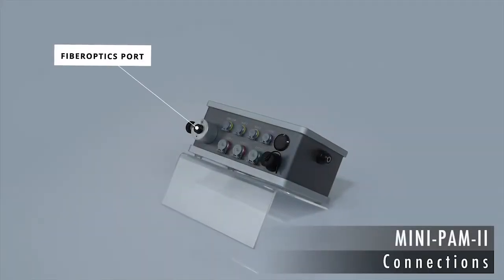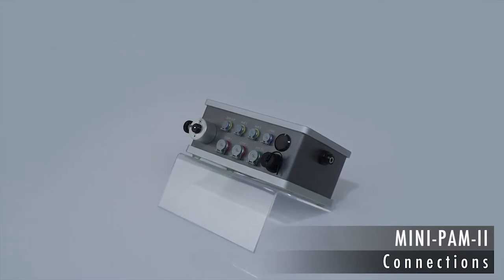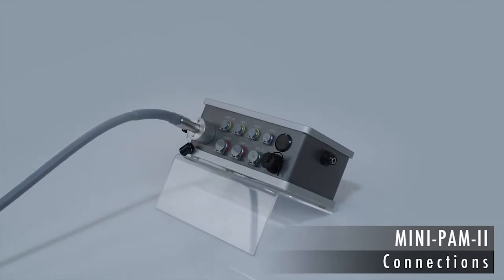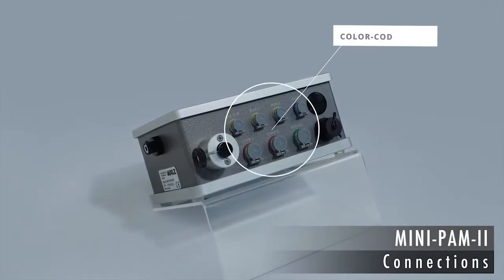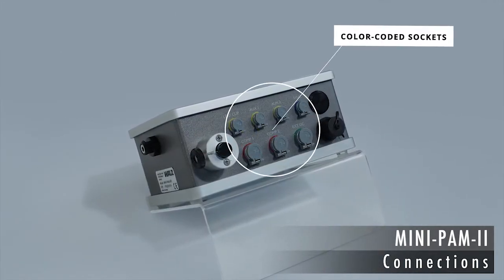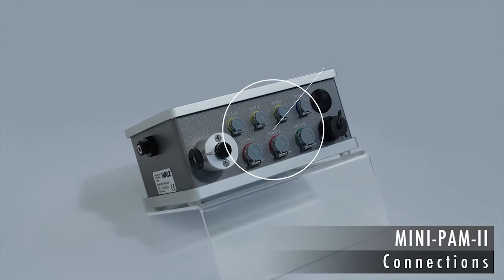A high transmission fiber optic cable connects the MINI-PAM2 to the sample. Color-coded sockets and plugs reduce the risk of mixing up connections.